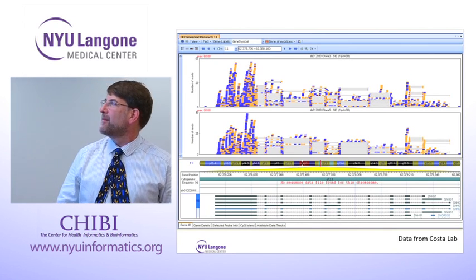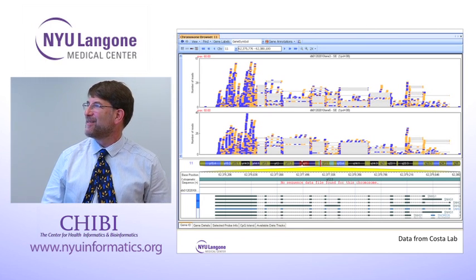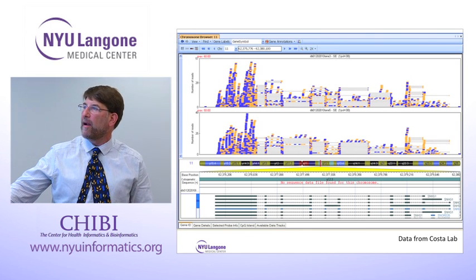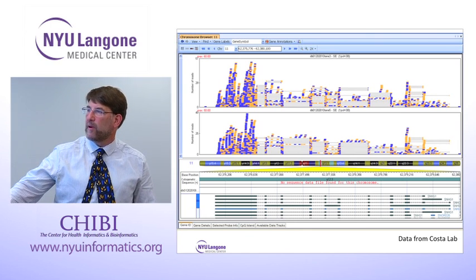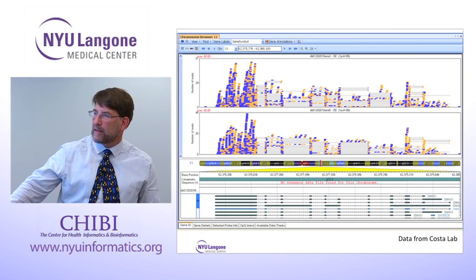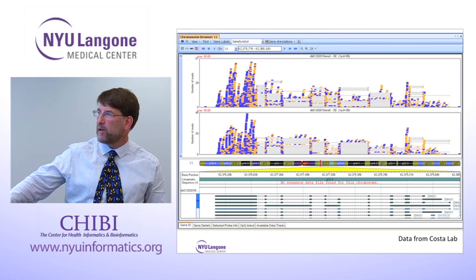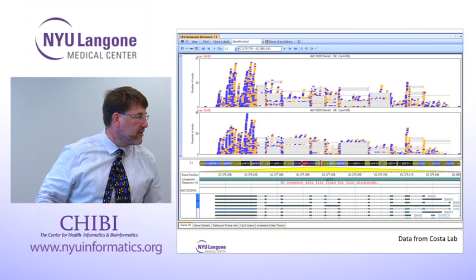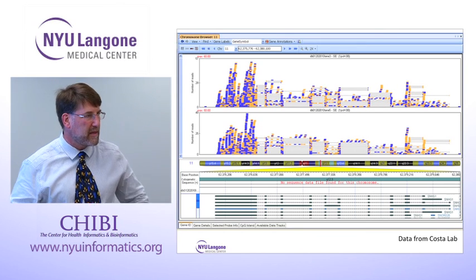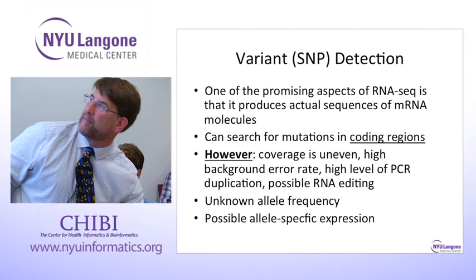And I've forgotten what this one shows. Oh well, it's pretty. Actually, I think this is just an example of alternative transcripts that are annotated, and our data support that pretty clearly. So here's one form of transcript. Clearly, most of the transcripts show an exon here, but a few show a read-through, and we see that read-through in the data. And it looks like it's a small percent of all the reads. So I think this is just showing that often alternative splicing does support the annotation.